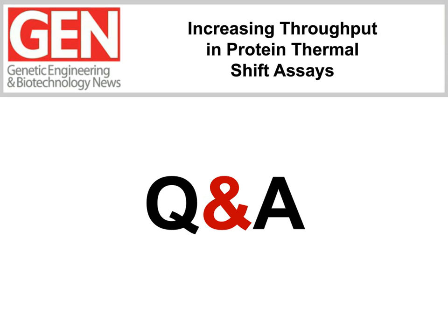So someone else wants to know, what percentage of proteins have you attempted to perform the thermal shift assays on that are not amenable to this technology? Our experience with the thermal shift is relatively limited. I would not say that we have done a lot of variations in the proteins and types of proteins that we have studied. But definitely we are looking into that direction, where we can give you an example set for each kind and variation of protein.